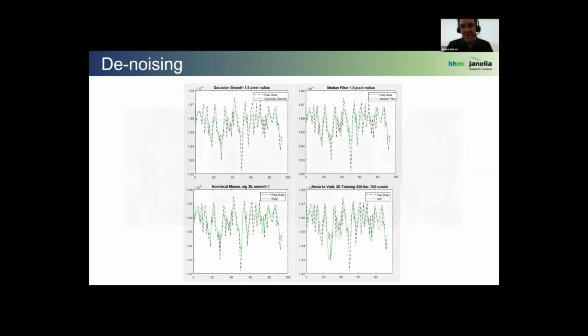And these yellow lines, you were probably wondering what they were for. Well, I actually wanted to see, quantitatively, how do these different denoising techniques work? And I won't belabor this too much, but I think the Noise2Void model does, by and large, a very excellent model. Like any machine learning technique, the results are going to depend heavily on how much training you're willing to do. But I think that's a general truism.